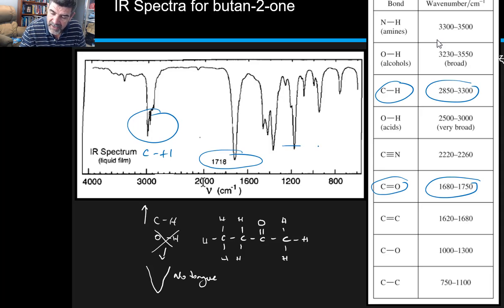We've got this whole mess in this little region here. I have to say sometimes this can be a little bit tricky for you to interpret. For example, we've got carbon-carbon bonds. And we know that there are definitely carbon-carbon bonds. And they occur between 750 and 1100. And there's a few of those in there.